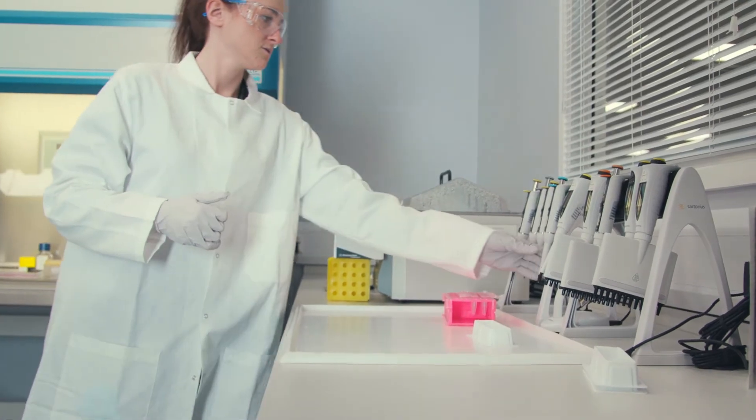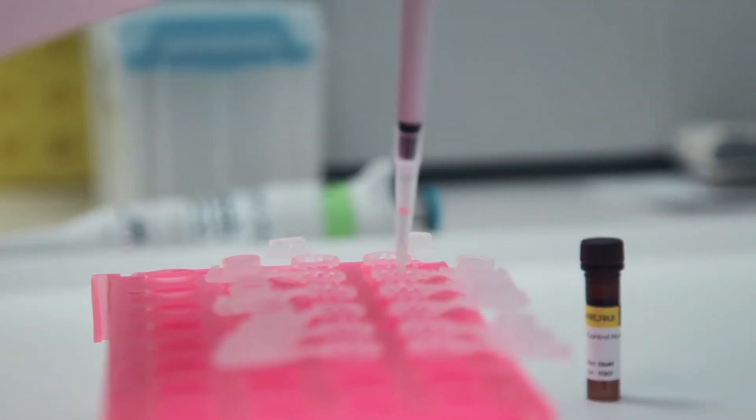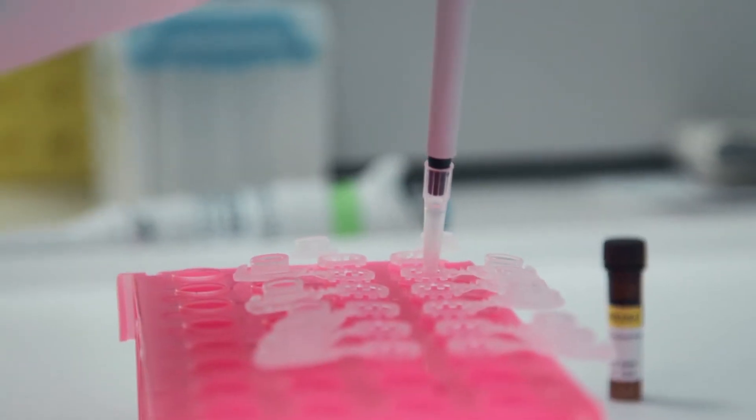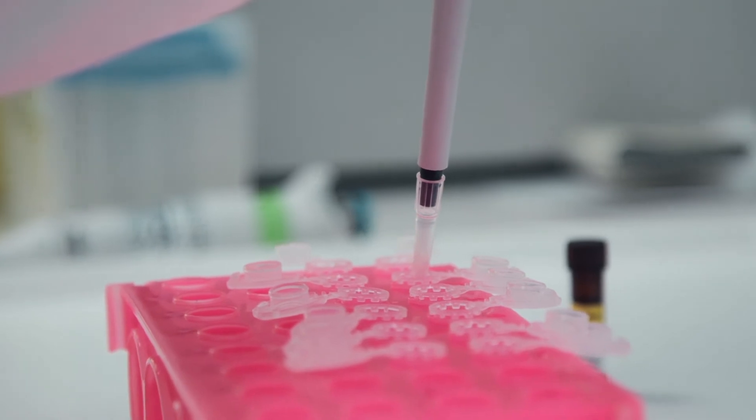If needed, the kit supplies all the reagents necessary to prepare a controlled human IgG protein standard for calculation of secreted IgG concentration. The detection range for this standard is 10 milligrams per ml down to 0.6 micrograms per ml.